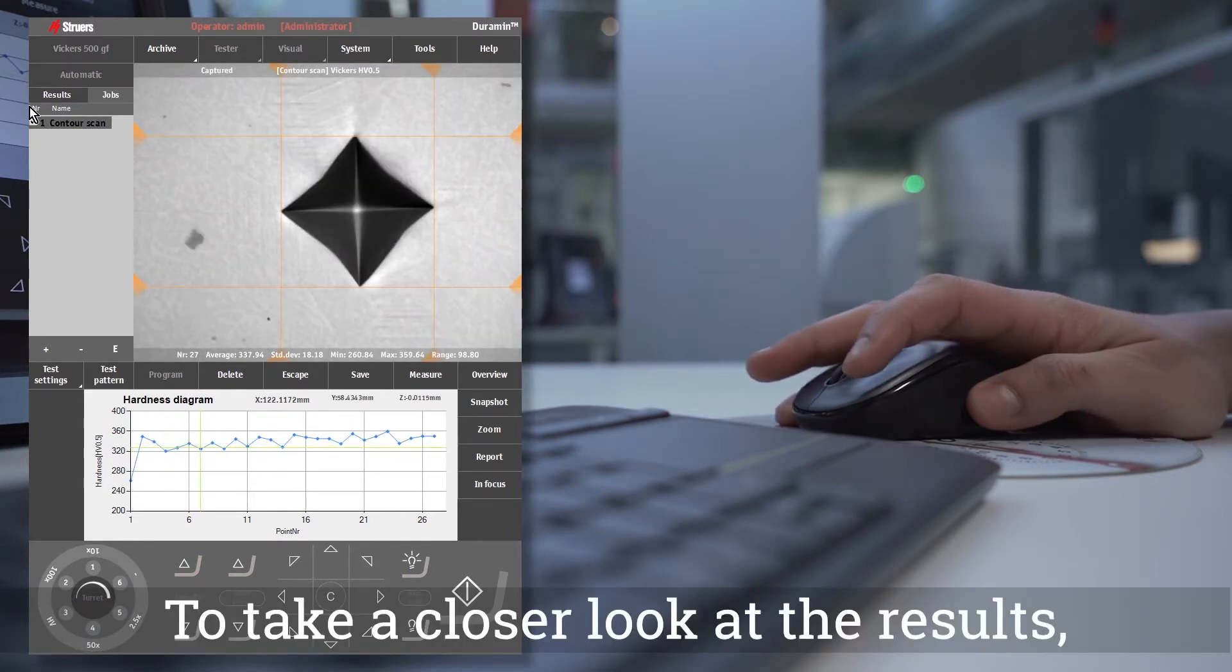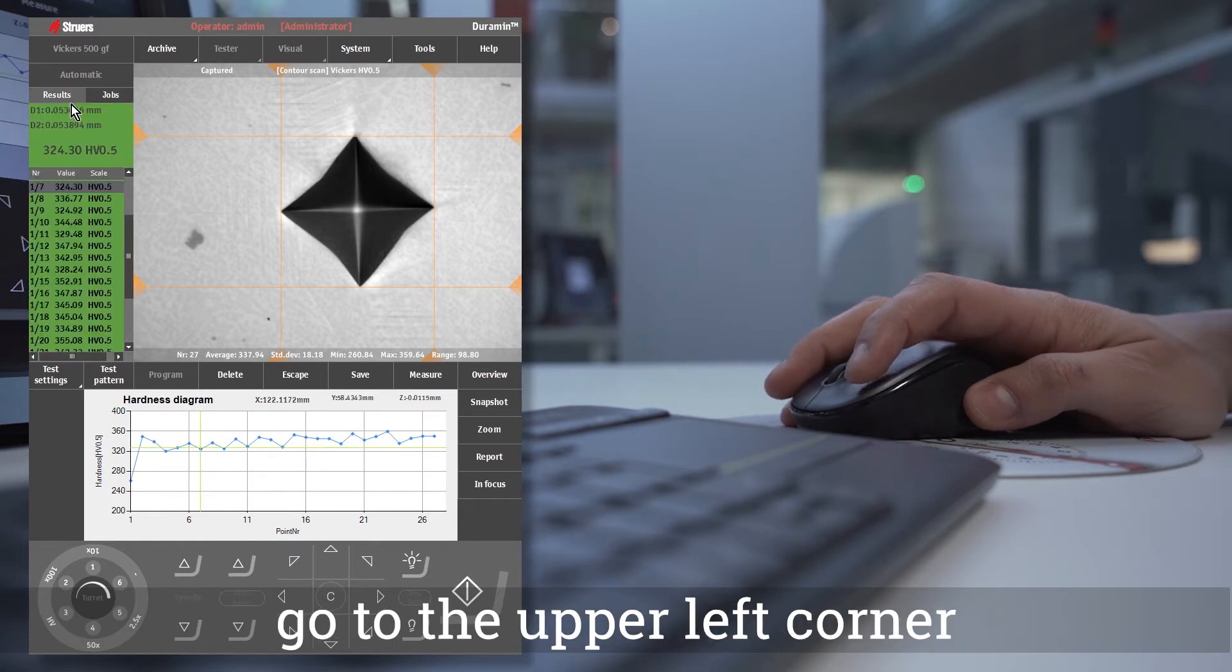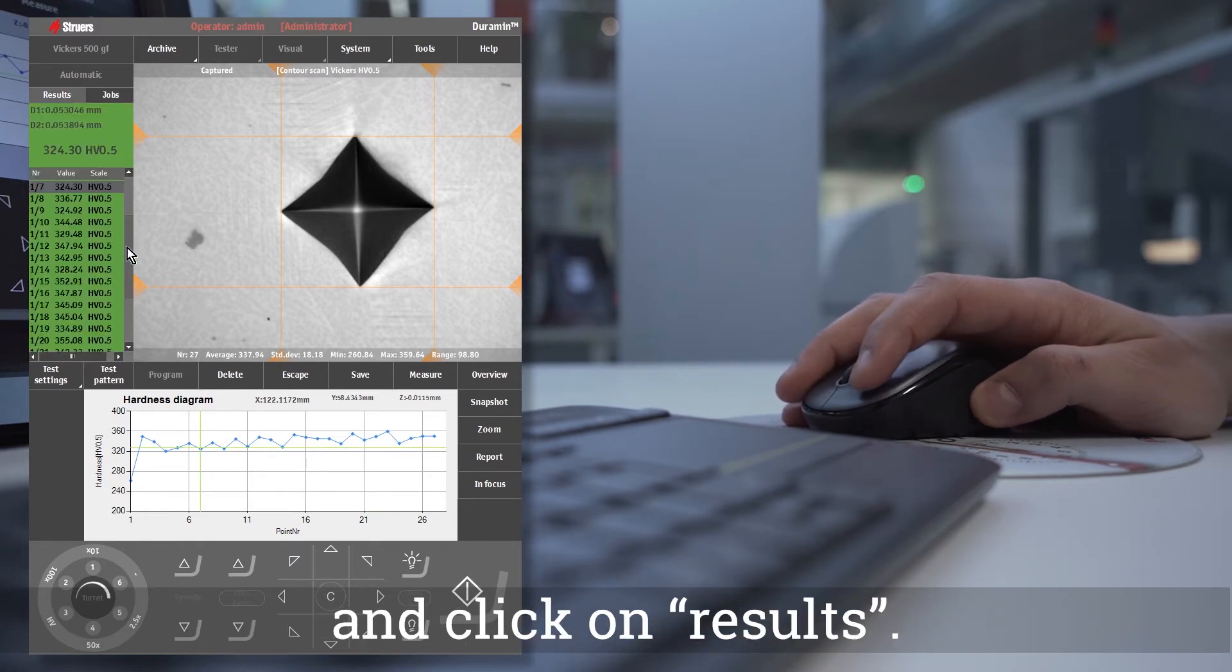To take a closer look at the results, go to the upper left corner, and click on results.